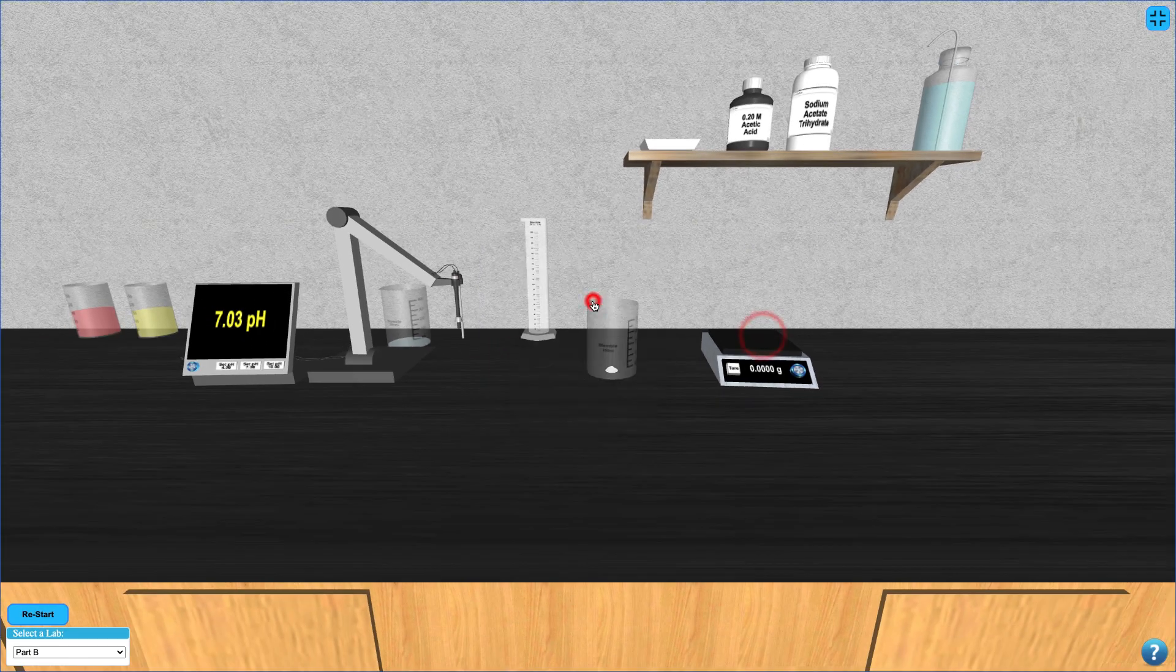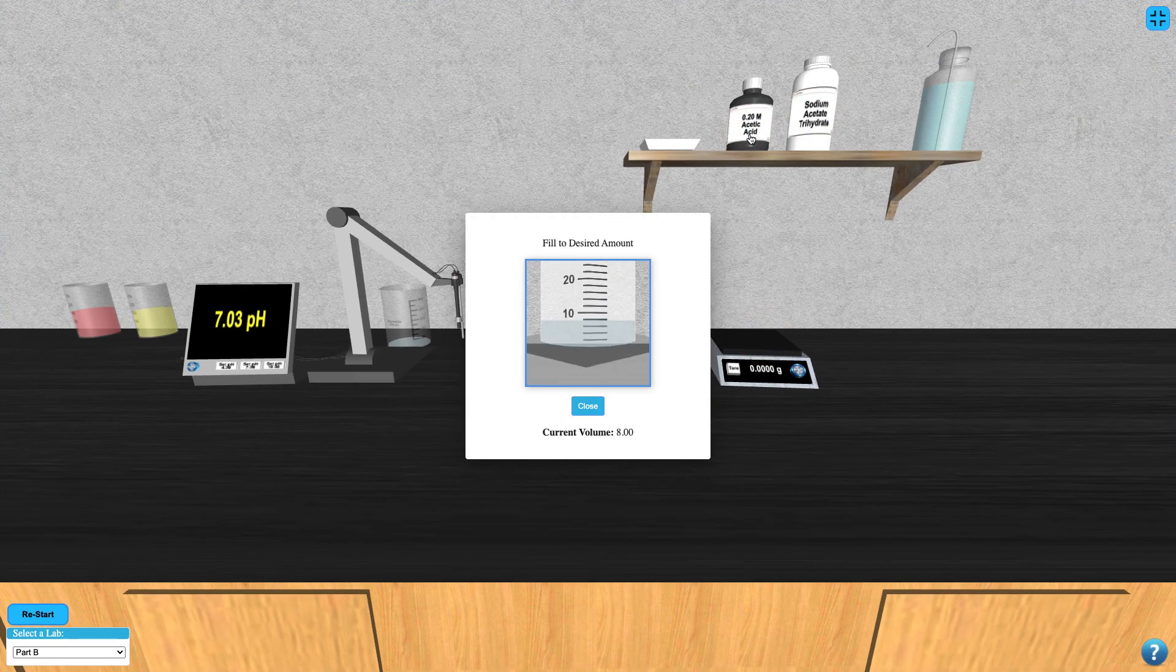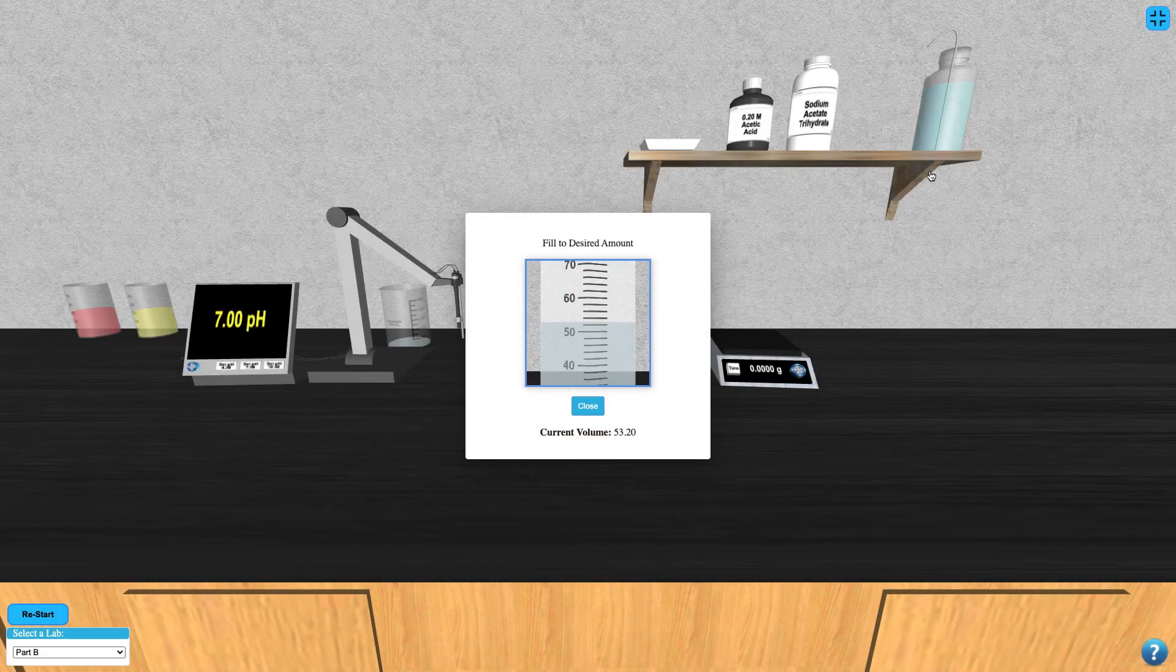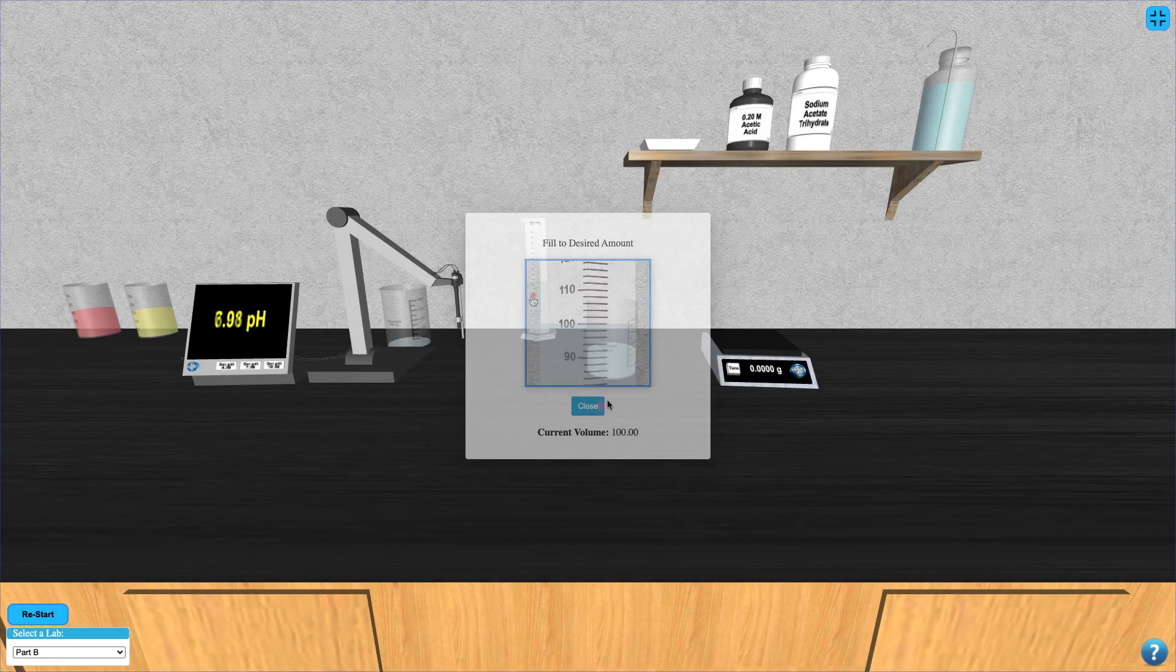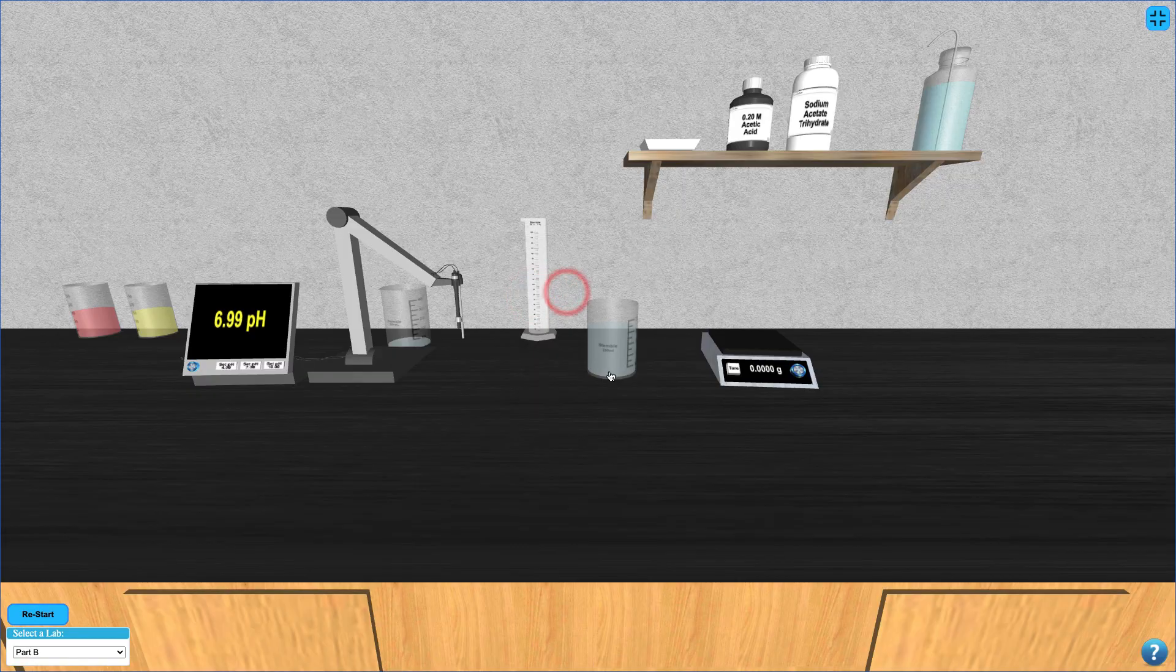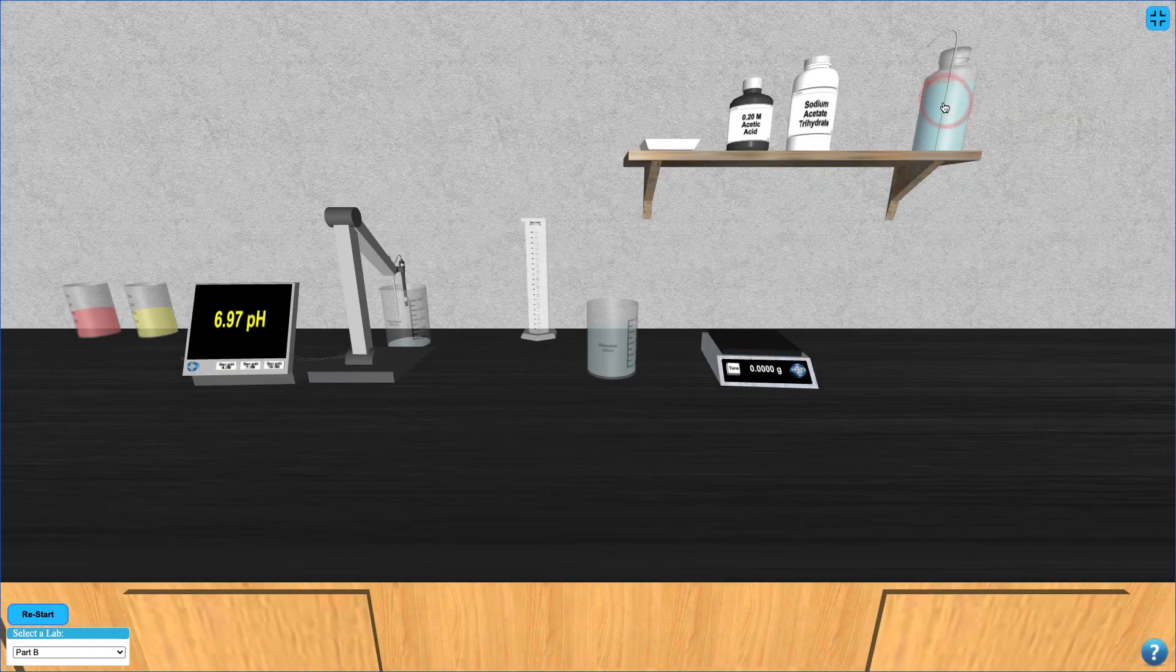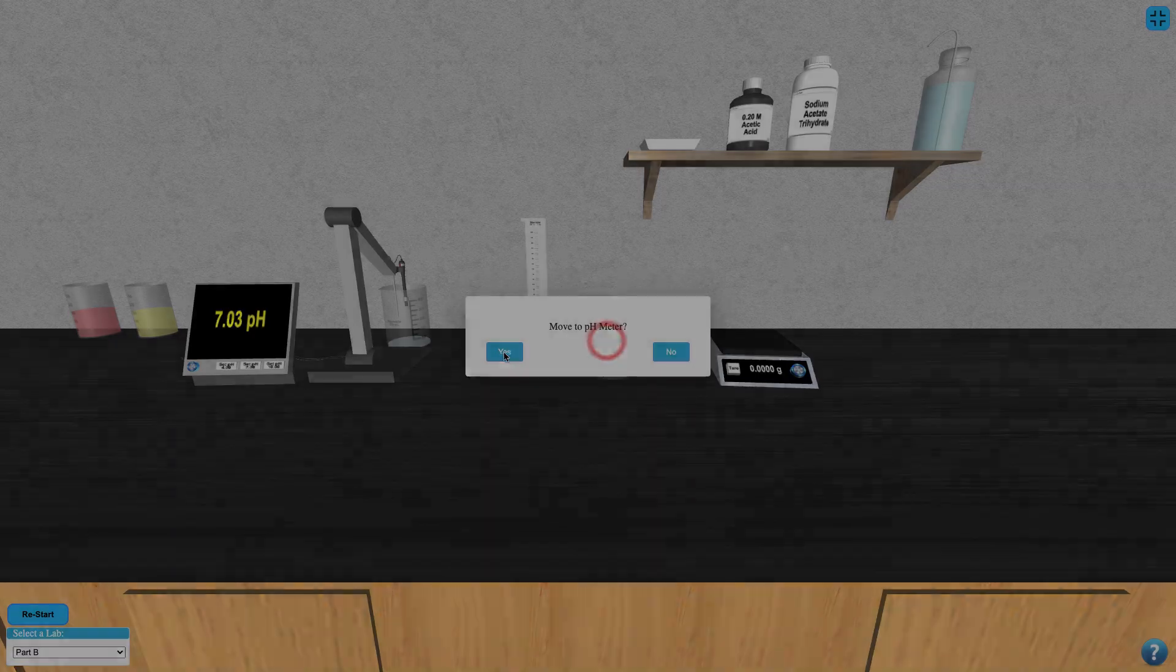Next, fill your beaker with 100 milliliters each of acetic acid and deionized water. Rinse the pH electrode again by clicking the deionized water bottle and then measure the pH of your solution by clicking on it and moving it to the pH meter.